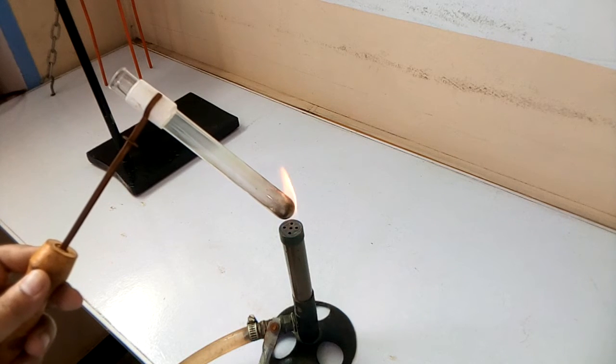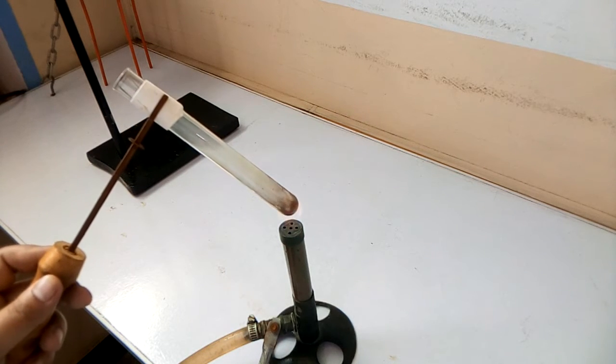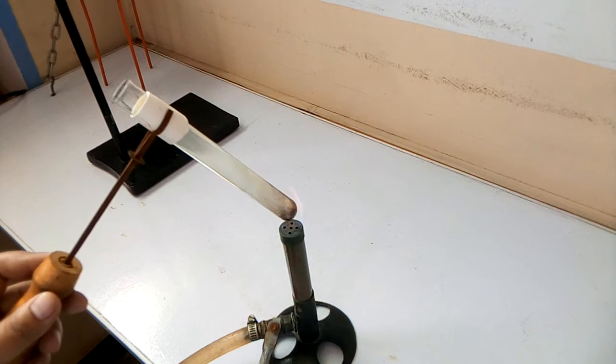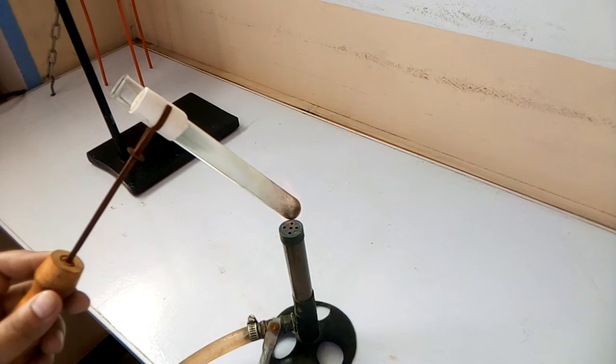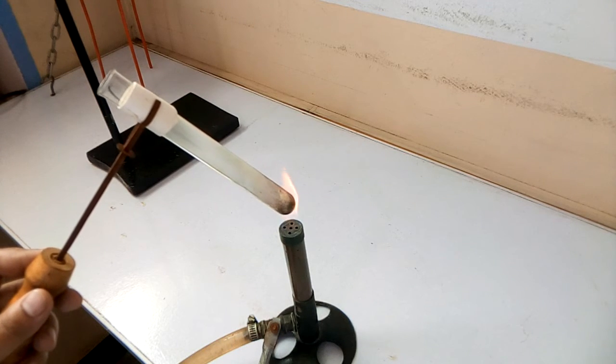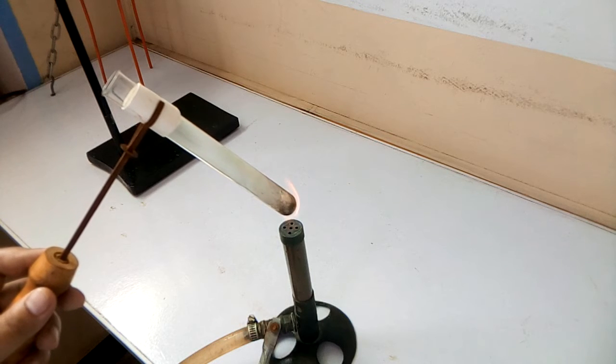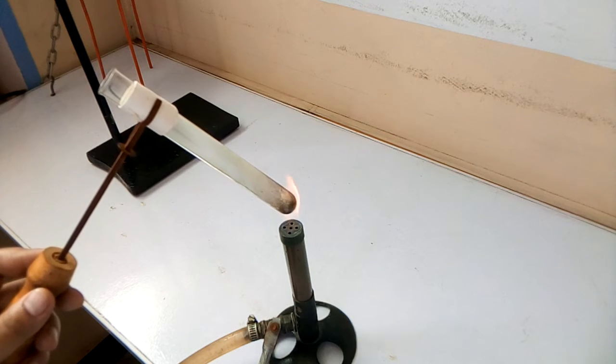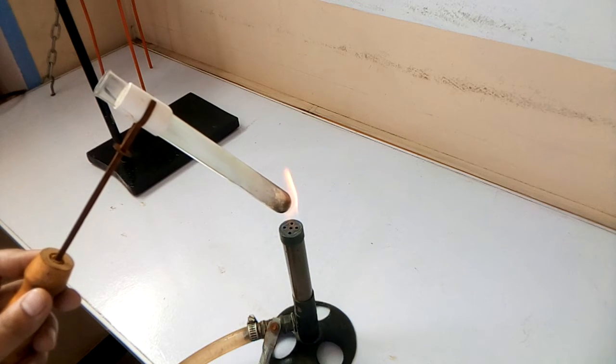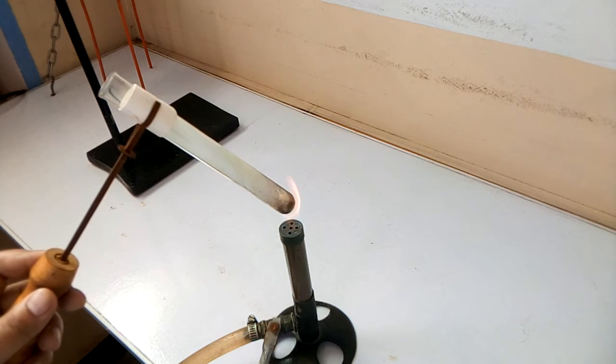White fumes can be observed inside the test tube which are showing that ammonium chloride is a solid chemical compound which has the ability to sublime. It changes directly to vapors on heating and the vapors on cooling change to solid without passing through the liquid state.